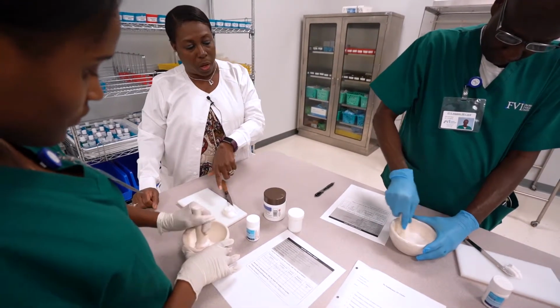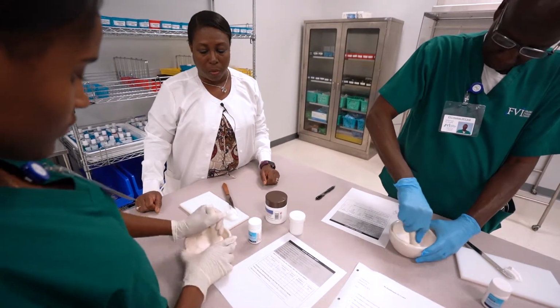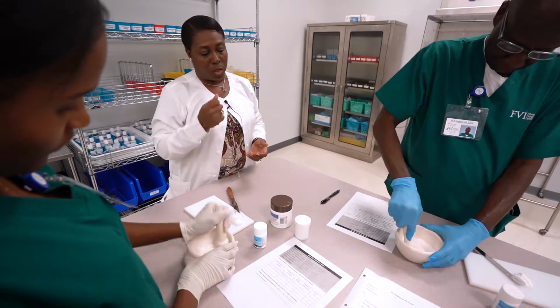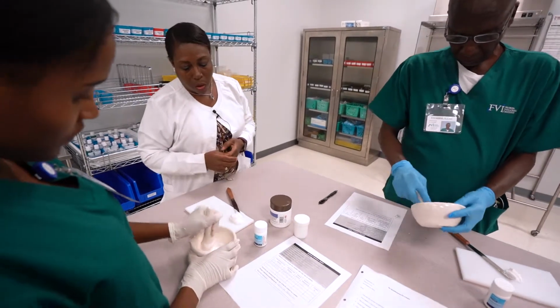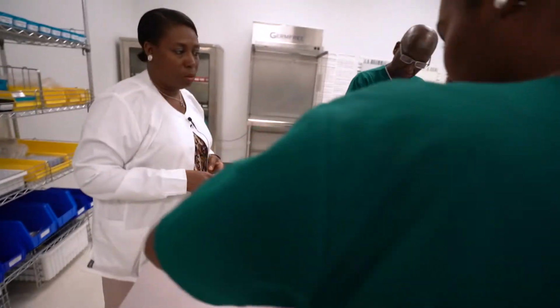And we see that they have already weighed out their derma-based cream. Now, once we have triturated it really, really fine, we would then add it to our ointment slab. Go ahead and add it.